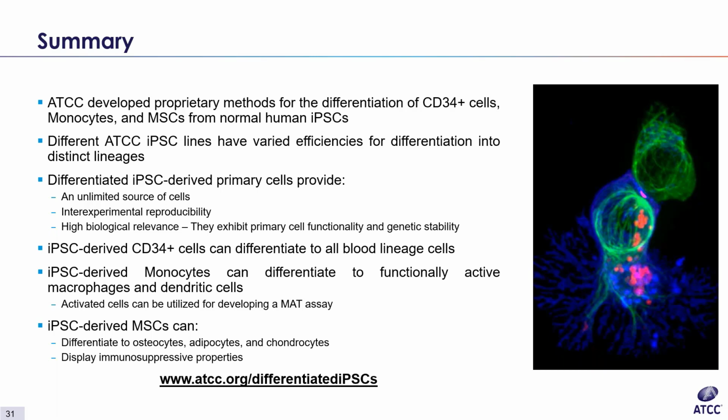So yes, monocytes are typically in suspension, whereas macrophages tend to attach to something when they're differentiated. You can look for phagocytic activity like I showed in the presentation. Some of the other substrates you could use to look at phagocytic activity could be either latex beads or apoptotic bodies, and you could create those by incubating cells with staurosporine.